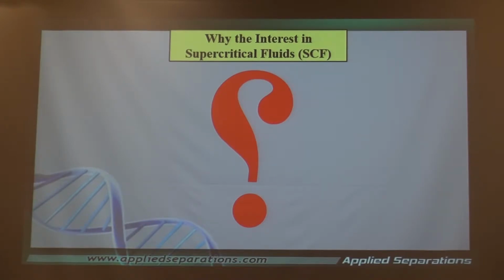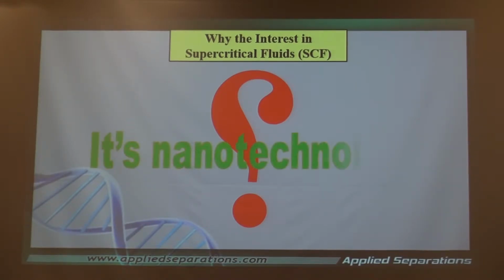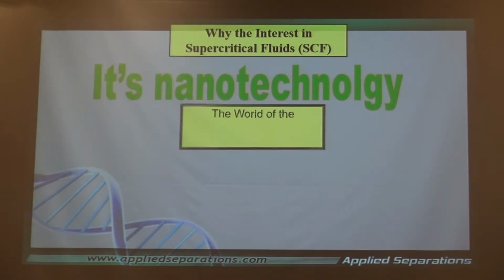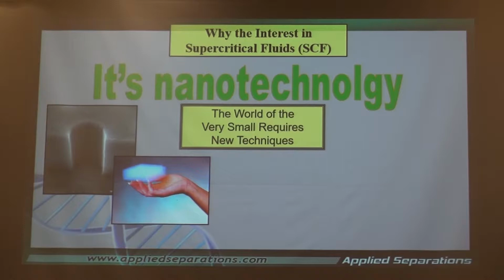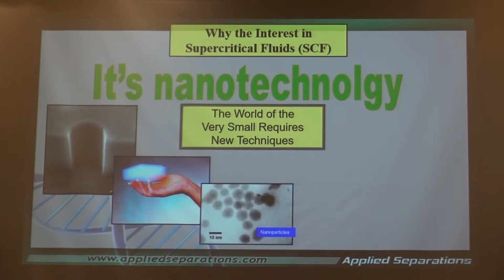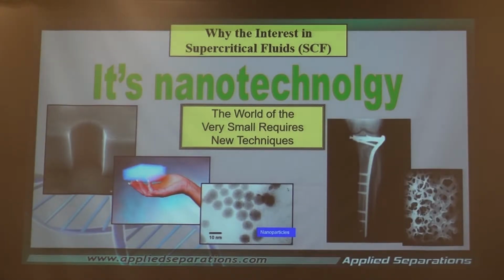Other reason for supercritical fluids outside of this is the area of nanotechnology. If we're dealing with the very small, we have to also deal with new techniques. Areas that we could talk about would be electronics, material science, for example, aerogels, smaller particles, and the ability to get into small spaces, for example, medical implants, to clean these. All of these are applications for supercritical fluids.